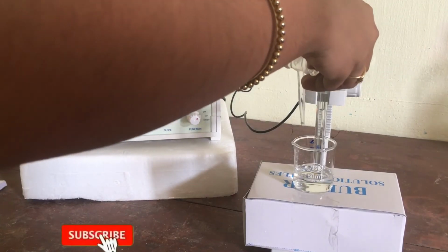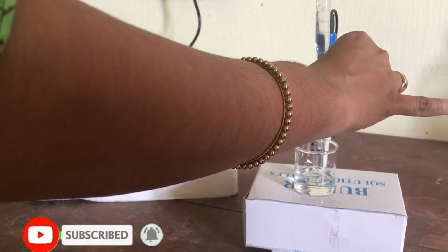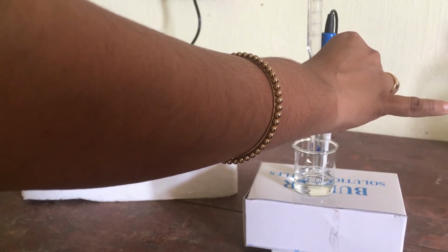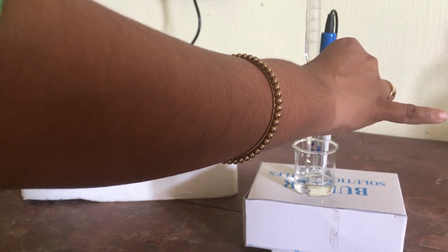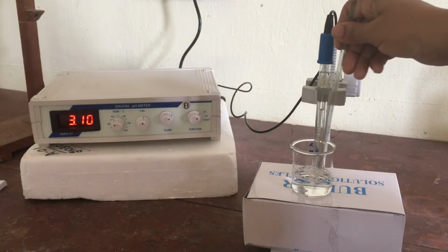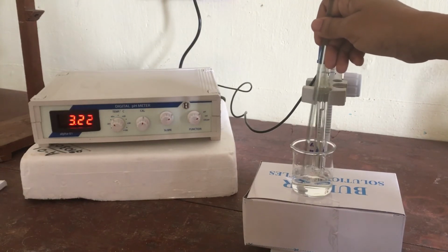Then we are starting by adding 2 ml of NaOH, and after adding that amount of NaOH, we need to stir it, and wait for a while to get a steady value in the pH meter.